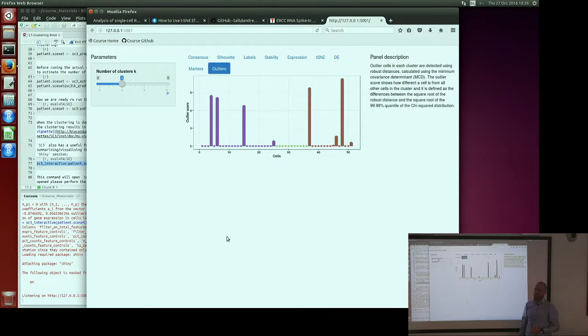Outlier score. Does outlier score mean the distance from the centroid? Yeah. But why? I expect some gradual distribution. So the question is, what does the outlier score mean, and why is it discrete? So we have zeros for some cells and some positive values for other cells.